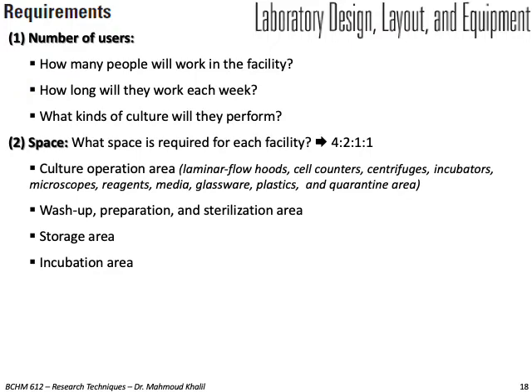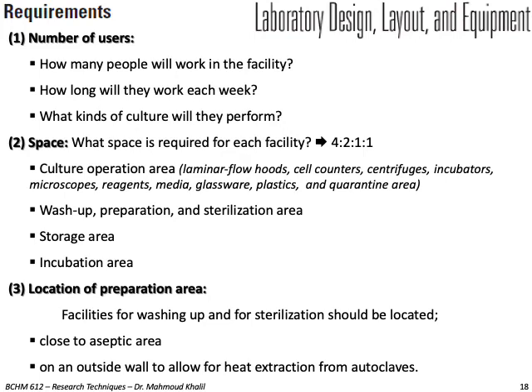So you need to know the culture operation area, the area where you will put the laminar flow hood, the cell counters, centrifuge, and a lot of other equipment and reagents. The wash up, the preparation and the sterilization area, the storage area, the incubation area. You need to know the location of the preparation area. The facilities for washing up and for sterilization should be located close to the aseptic area on an outside wall to allow for heat extraction from autoclaves.